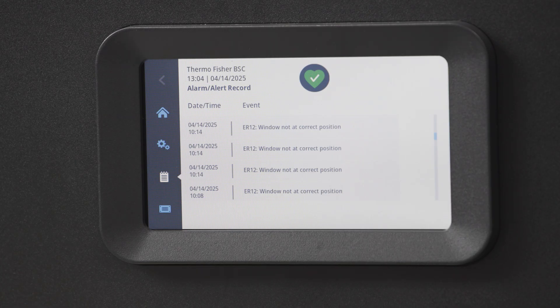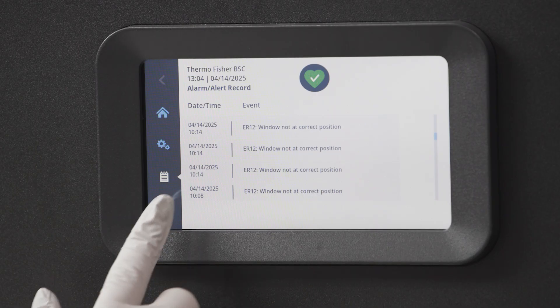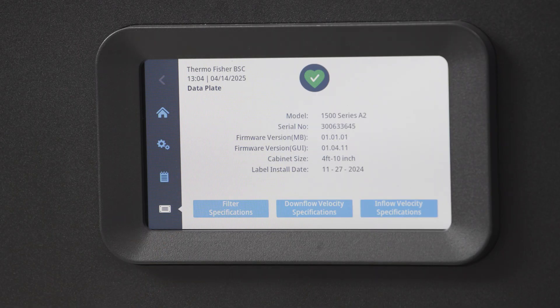Under the event log, you'll see a data plate icon. When you touch the icon, you'll see information meant for a field certifier, including the model's velocity and measurement specifications. You'll also find the serial number and firmware versions.